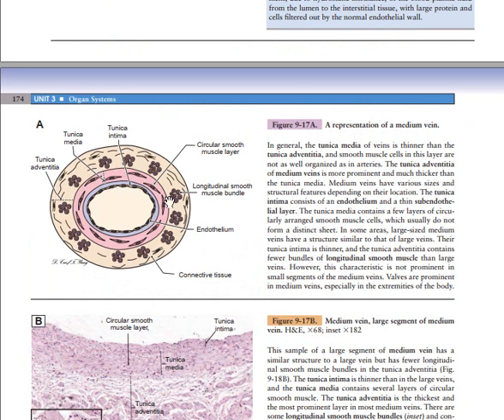You have the smooth muscle cell layer, which is the tunica media, and then you also have the subendothelium at the level of the tunica intima. Then lastly, you have the tunica externa. The specific characteristic of veins is that the tunica externa, or adventitia, consists of longitudinal smooth muscle. These are the longitudinal smooth muscle you can visualize here.